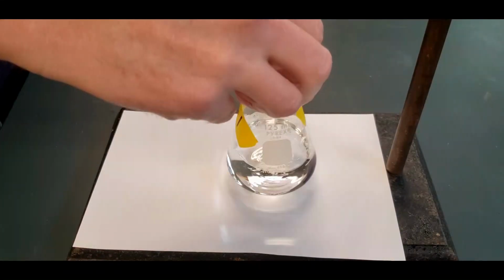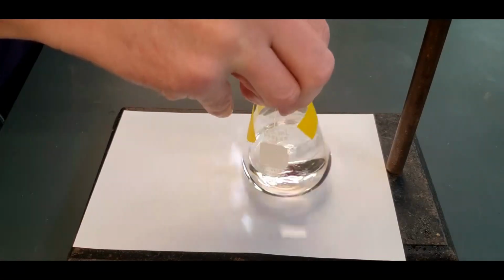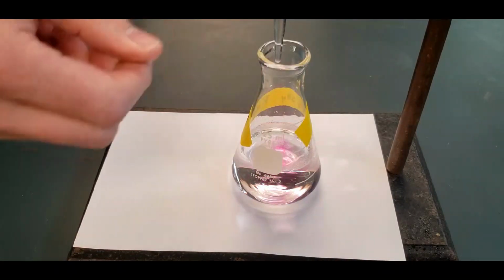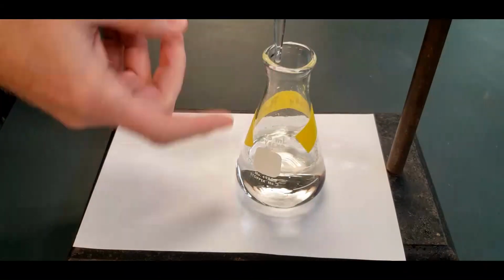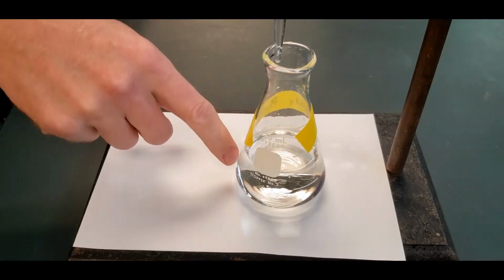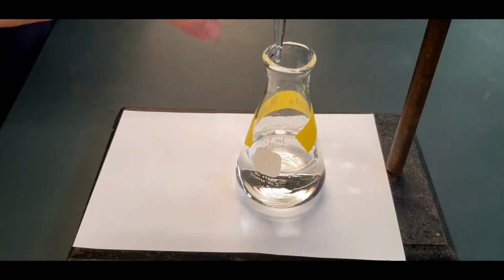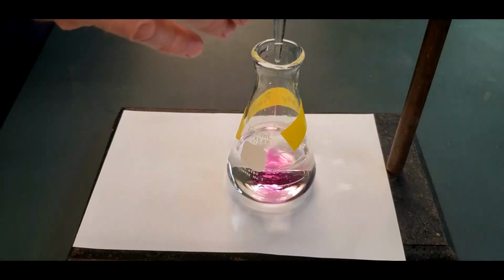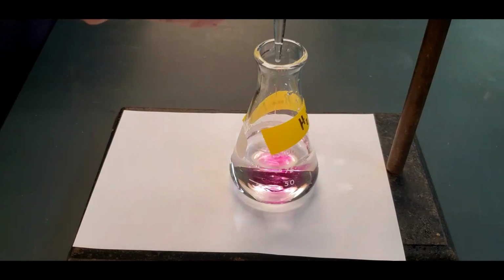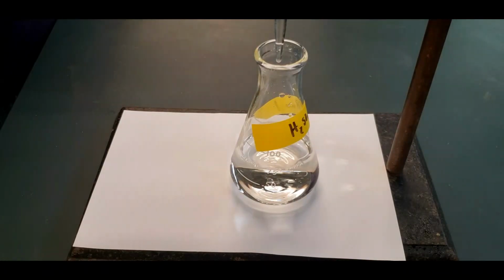Okay. And so what I'm going to do is just run this pretty fast for now. And I'm just going to swirl. And you can see that I stop. The pink color indicates basic solution. That's what's gone in, the sodium hydroxide. And then when the sulfuric acid catches up, it neutralizes the base, it goes back to colorless. So when the color stays, that means all of the sulfuric acid is gone. We know the titration is done. And you can see now that color is really coming. I'm going to slow it down now.